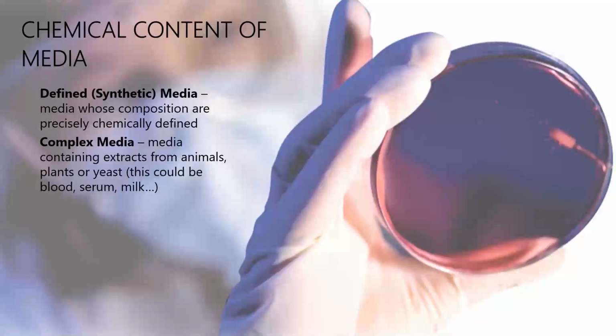There's bovine brain agar, we have casein milk agar, things like that. It's really hard to get a milk agar to come out identical every time. It'll probably be very close, but it's not nearly as specific as a synthetic or defined media would be.